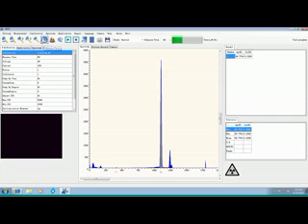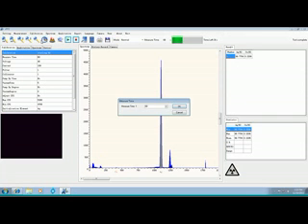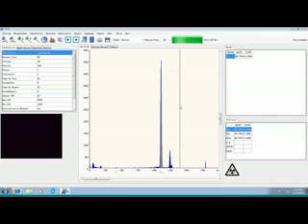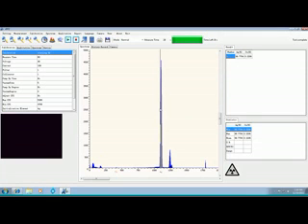And this machine is very accurate at 60 seconds. For demonstration purposes, I think we're going to run these at say 20 seconds. I would suggest for the actual operation you run it no less than 30 seconds and 60 seconds if you want to have very good accuracy. So at this point we change the measuring time.